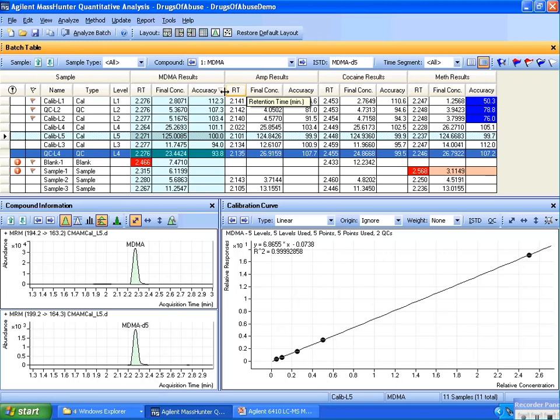That's quite useful. Another feature that I'll show you in terms of column management is that if I wanted the accuracy for some reason to be at a different place in the row, I can pull that and move it and it will show up in a different position in terms of the order here.